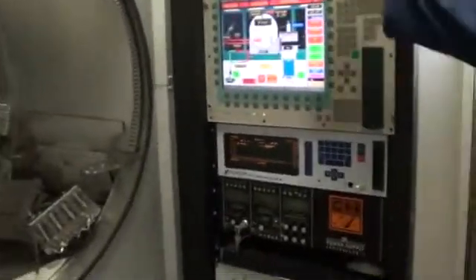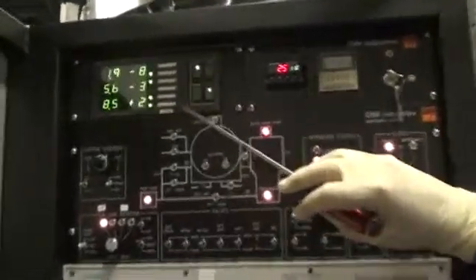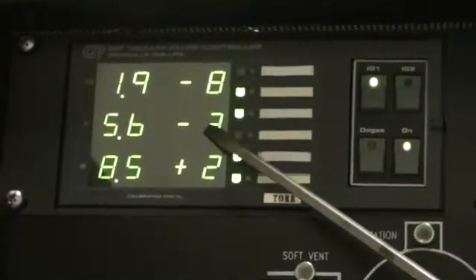Tracy, I'll pass it on to you and just give us the good overview here. Okay, controllers. This is the vacuum readout and controller for the vacuum chamber and cryopump. Also the four-line pump right here.